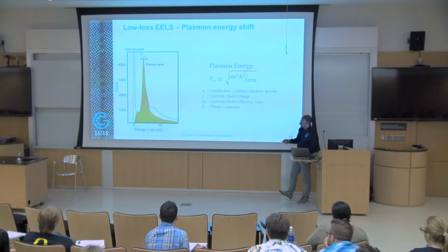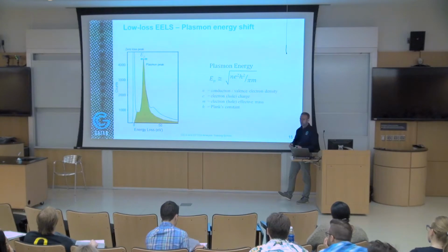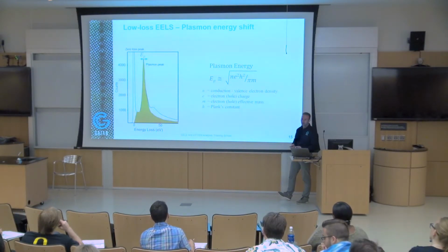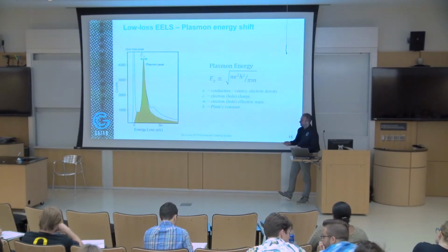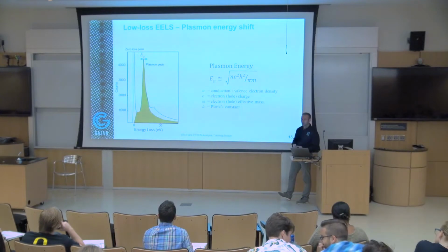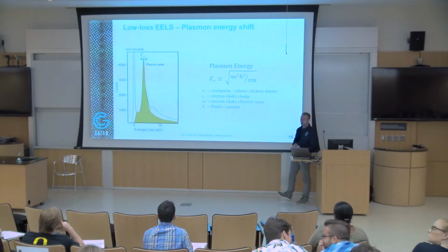So you can see that this is actually removing completely the zero loss peak. You're doing something called deconvolution. You basically remove this peak. So in general, as your sample gets thicker and thicker, you get more and more inelastic scattering. You form several plasmons, and then all these plasmons kind of converge into one big plasmon. When you look at a very thick sample, you don't see the zero loss peak anymore. You just see the plasmon. Only, yeah. So the distance between this point and this point is the same as between this point and this other point, which is the second plasmon. So if you work with a thin specimen, you're not going to see the second plasmon.